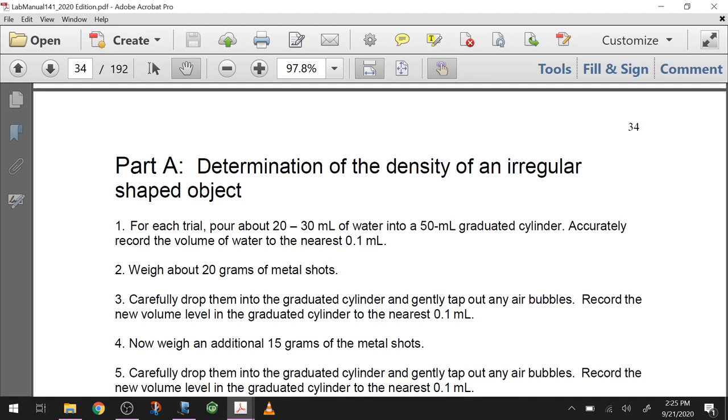In the lab, these are basically like copper and tin irregular spheres—copper shot that are a little bit bigger than your fingernail in diameter. It's impossible to get very accurate amounts added at a time when your pieces are two or three grams each. But other than that, as long as it fits in the cylinder we're okay.